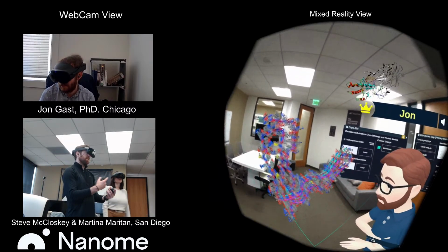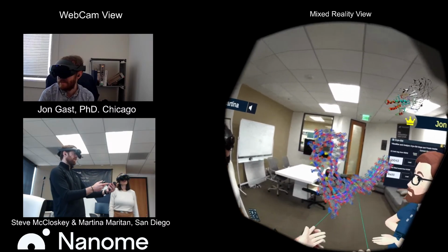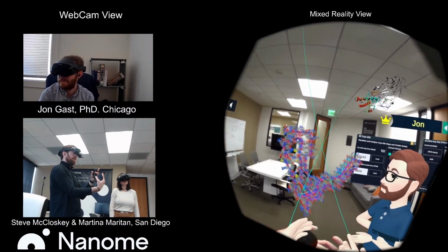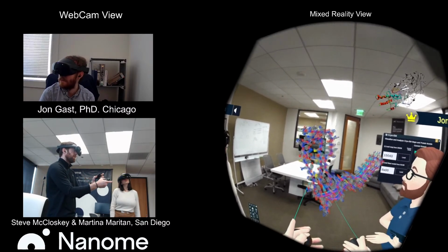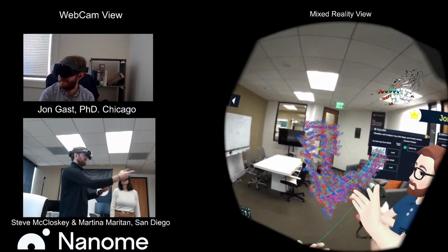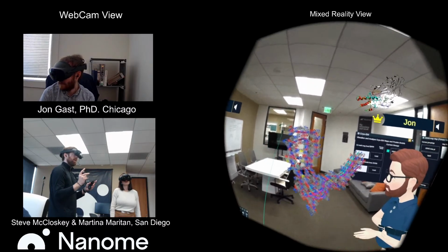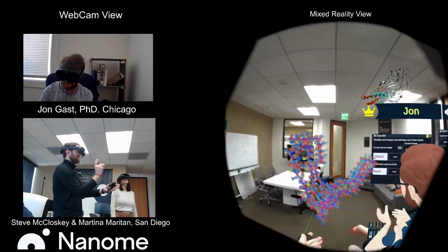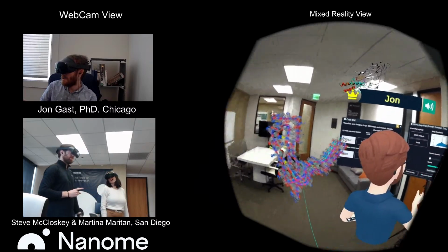Yeah, we've seen a lot of people use electron density maps calculated from, like, X-ray diffraction, trying to understand that experimental data better to see if the ligand is actually co-crystallized properly, to make sure that when you're looking at the computational models, you know what the accuracy is on the experimental model. Because a lot of people will look at the balls and sticks in the computational model and say, oh, this is exactly 3 angstroms away, when if you look at the experimental map, there are blobs and it's not precisely 3 angstroms away, but there's some variability there.